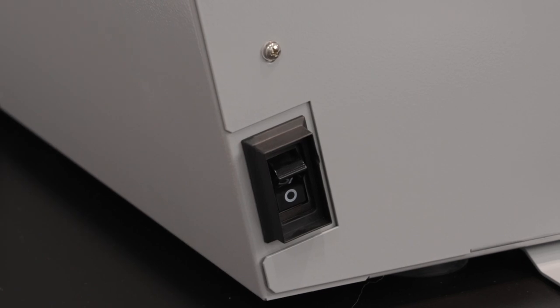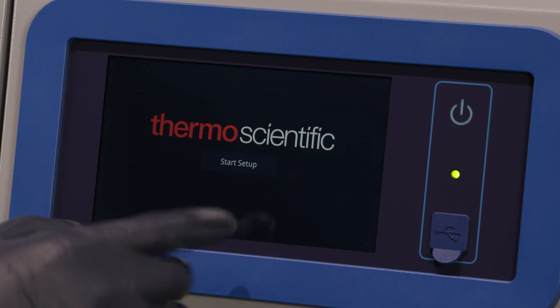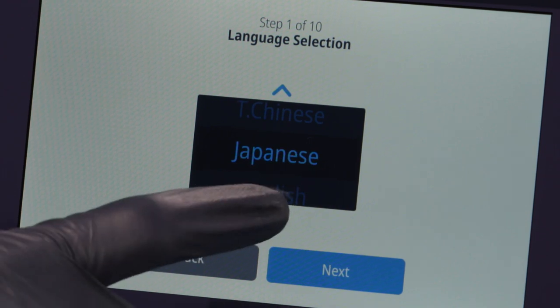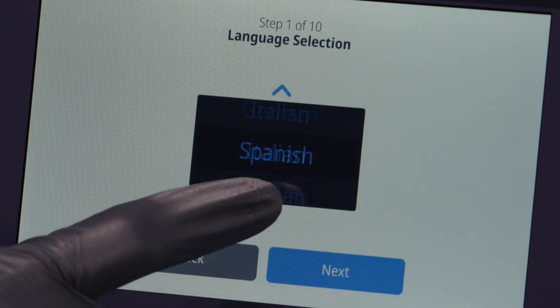Once the controlled rate freezer is powered up, the Thermo Scientific logo is displayed on the front screen. If this is the first time the unit is being turned on, an initial setup must be completed. Press the Start Setup button to initiate the setup. The first step is to select the language. This screen allows you to specify the preferred display language. Once the language is selected, press the Next button.